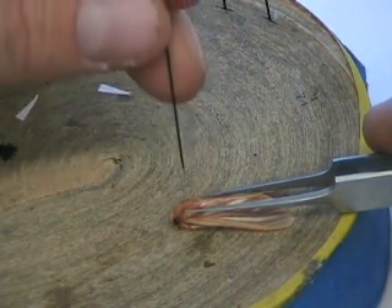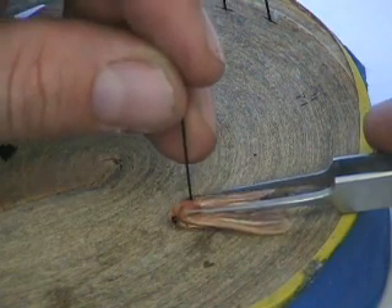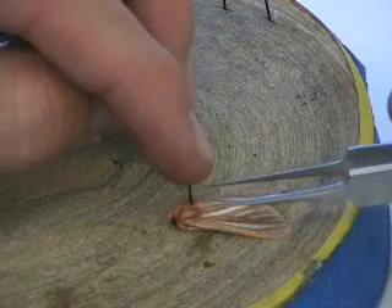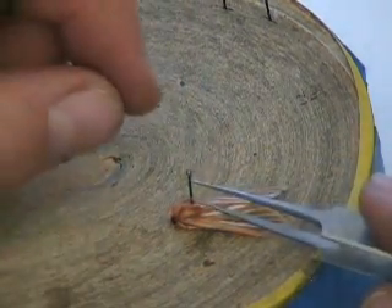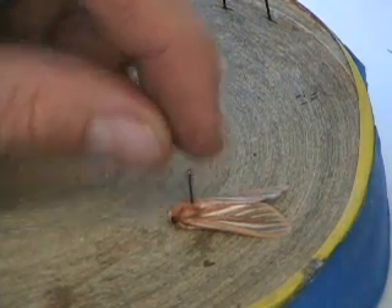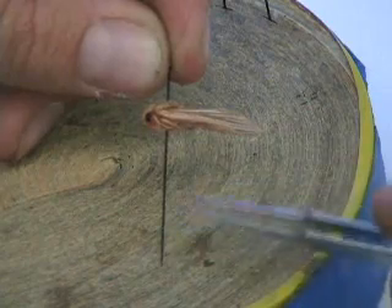I'm going to take my pin and push it right through the center of the thorax, all the way down. I want a gap of at least 10 millimeters between the specimen and the tip of the pin — enough space for at least four labels.